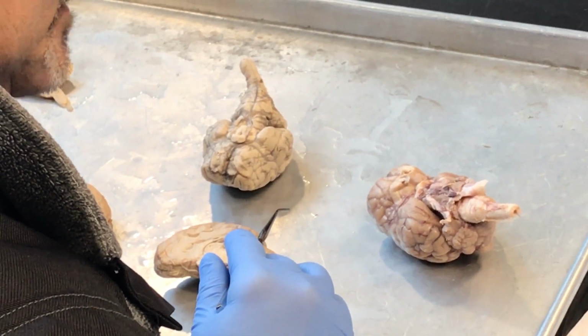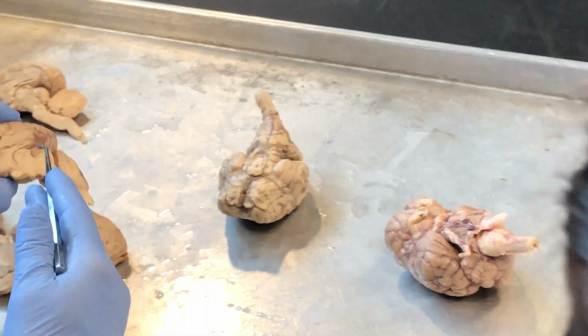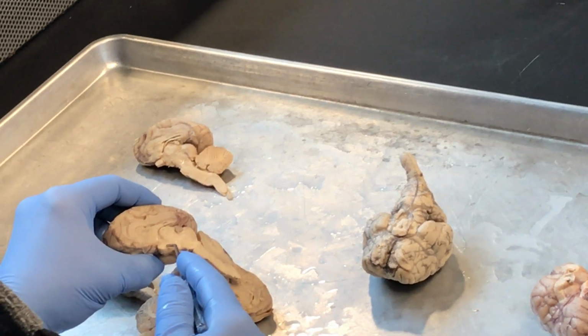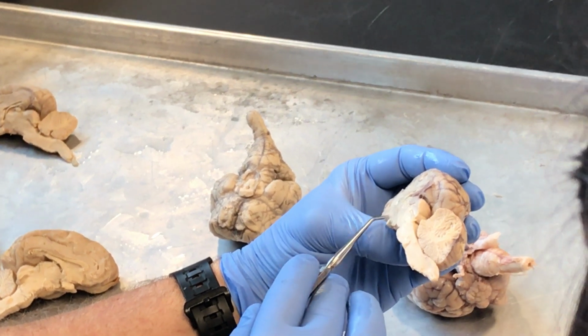What do we have next? Third ventricle. So we talked about thalamus. We said this is the intermediate mass of the thalamus. The thalamus is right here. Hypothalamus is here. Optic chiasm is right there. Thalamus, hypothalamus, optic chiasm.